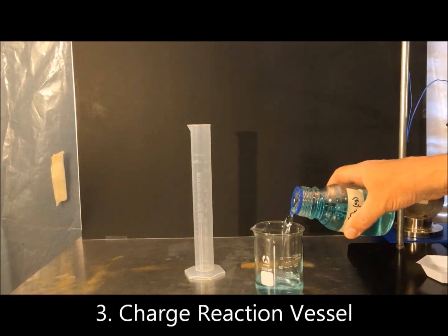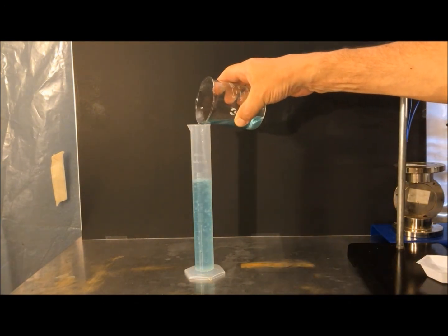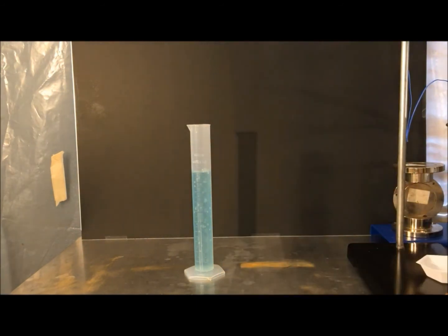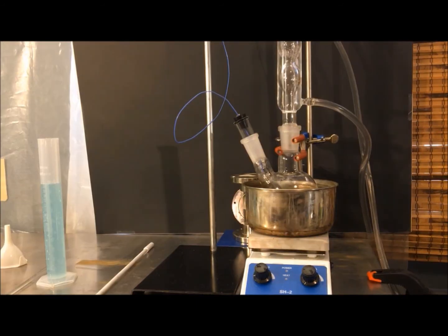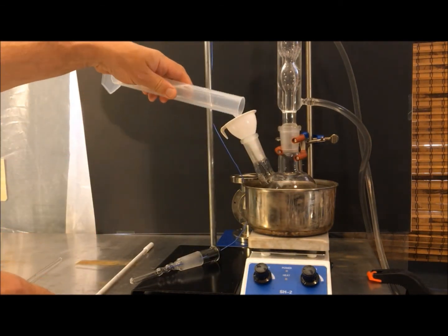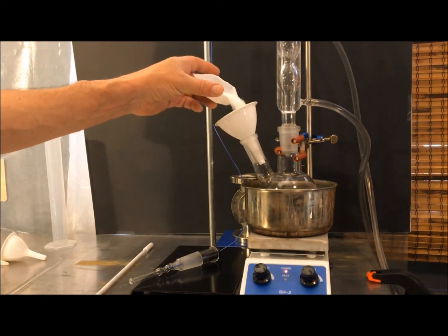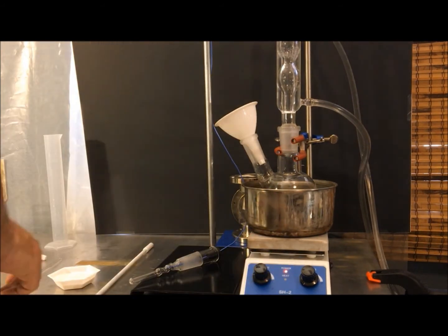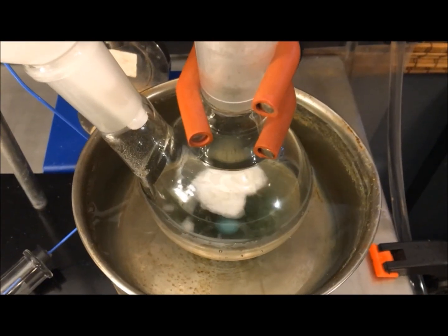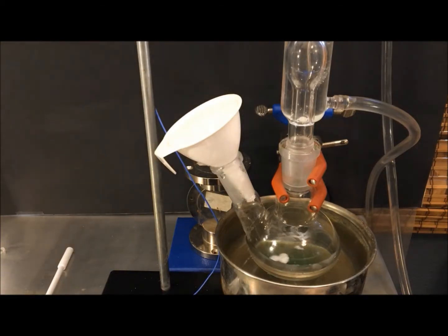Start by measuring out 100 milliliters of the stock copper sulfate solution, and then add that to the round bottom flask. Next, add the povidone. Now, if you thought the copper sulfate was bad, this stuff is like a nightmare.